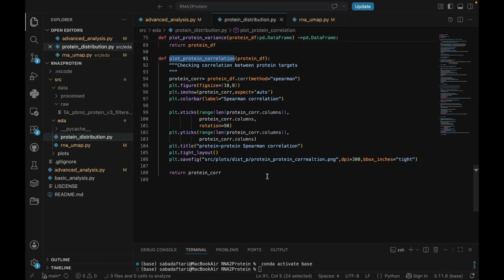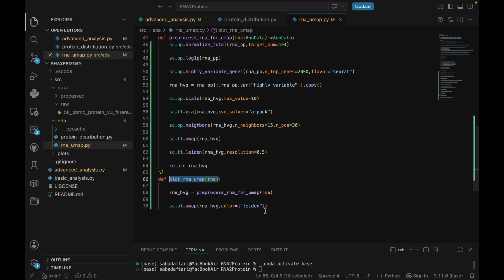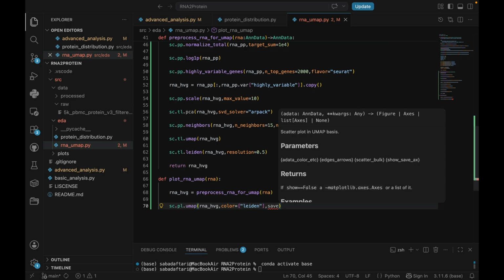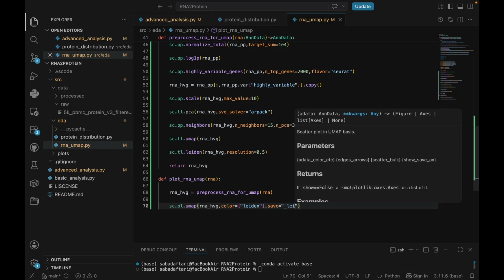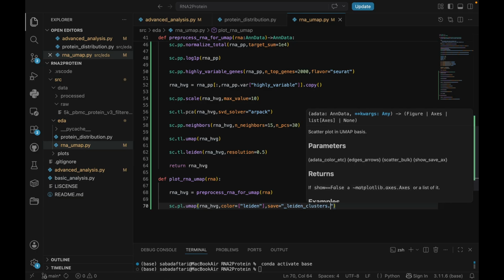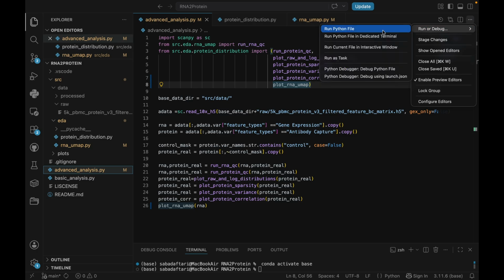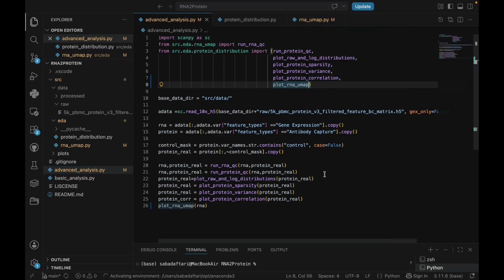So in single cell data, you usually don't know the true number of cell types in advance. Also, k-means prefers round ball-shaped clusters, but biological cell populations are often irregular, curved, or connected by transition. So k-means is good when clusters are round and you know how many you want. Leiden is better when clusters are graph-shaped and k is unknown. Now let's run and see this plot.